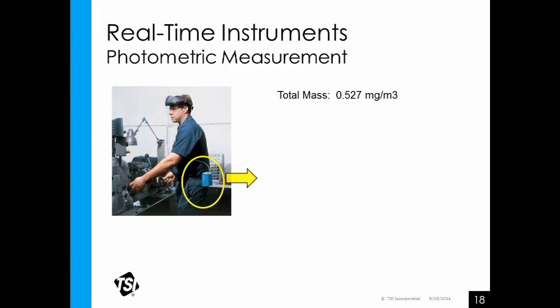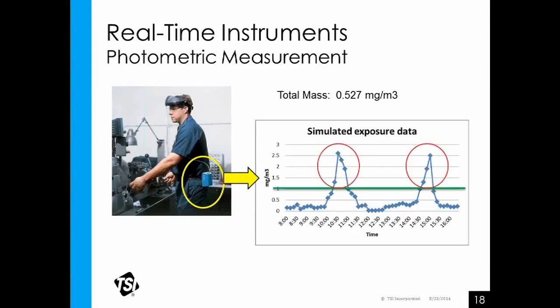Another way of using these instruments is to think of it as a noise meter. You'd take a noise meter to sample around a shop or different places. You could take the sample the same time every day, the same time every week, and just trend your aerosol levels over time. And as they start trending up, you ask, what's going on? Why are the aerosol levels increasing?